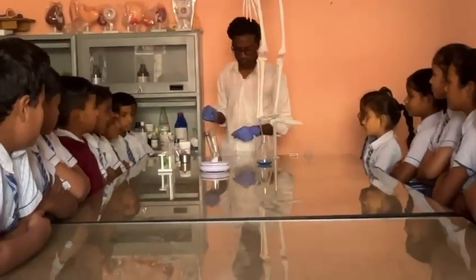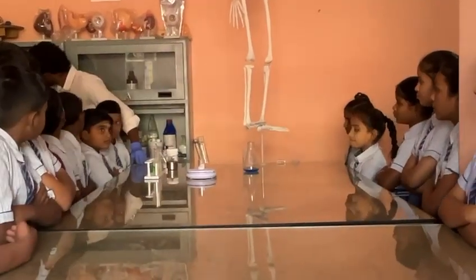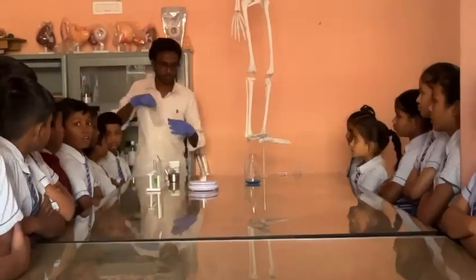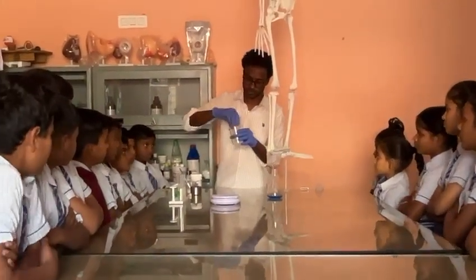And we have to dissolve that also in another beaker, so I am taking one more beaker to dissolve this 10 grams of salt.